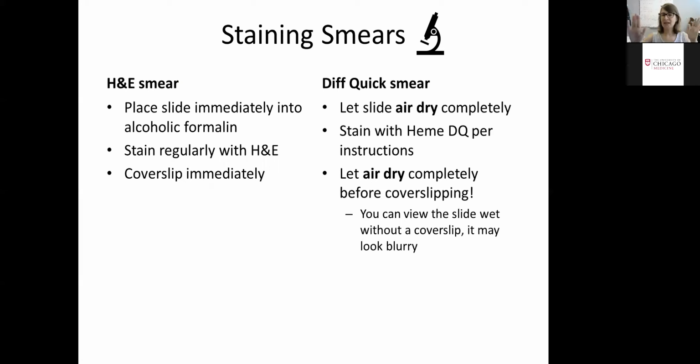After you smear it, let the slide air dry completely. Don't touch it, don't put it in anything, smear it and sit it on the counter, all right? Once it's completely air dried, then you stain with the Diff Quick. Then you let it air dry completely again before cover slipping, okay? It's the consistency of the stain that requires air drying both before and after.